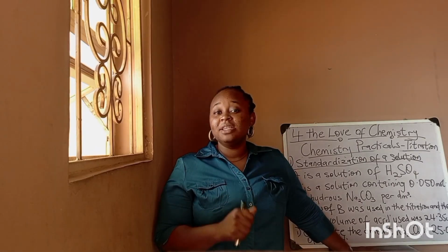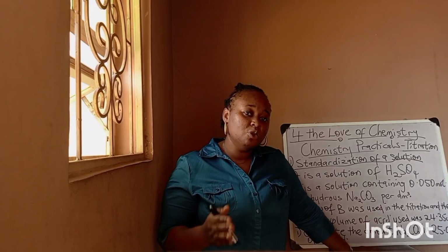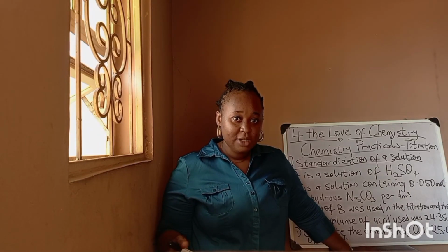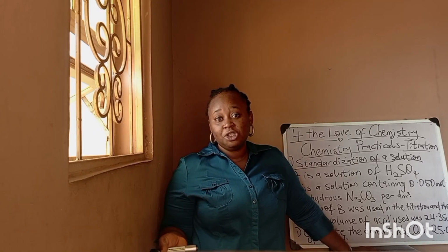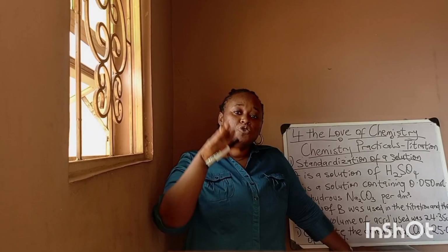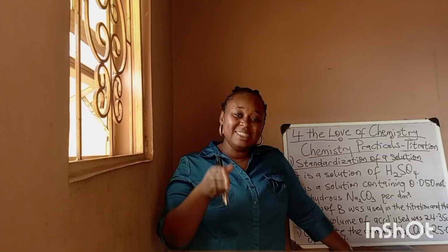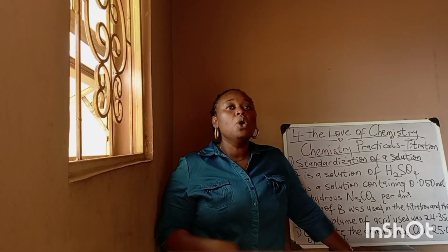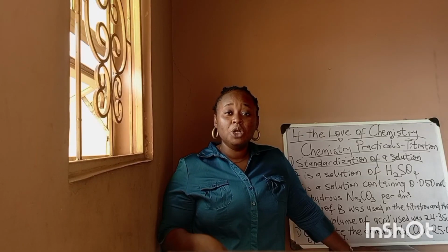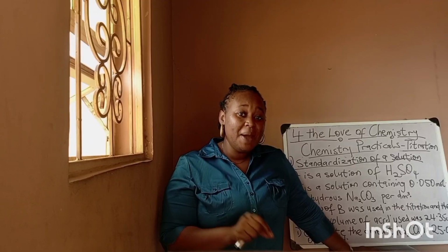First, I want to define a standard solution. A standard solution is a solution with a known concentration. So either you know the mass concentration or you know the molar concentration. But so long as you know the concentration of the solution, then it is a standard solution. For example, in standardization of a solution, we get to know the concentration of the solution by titration.